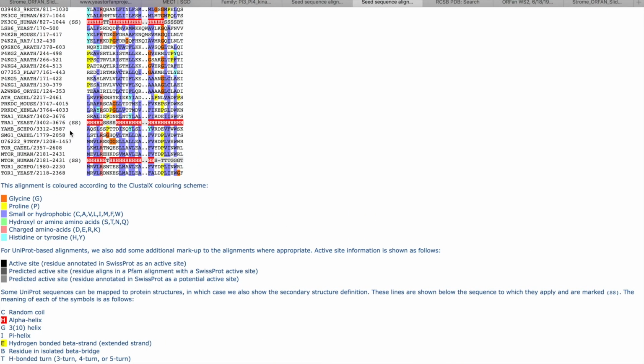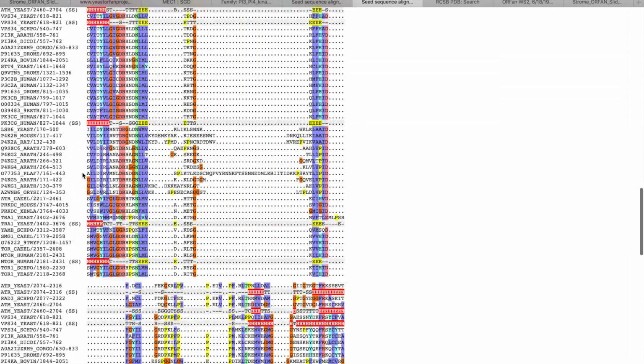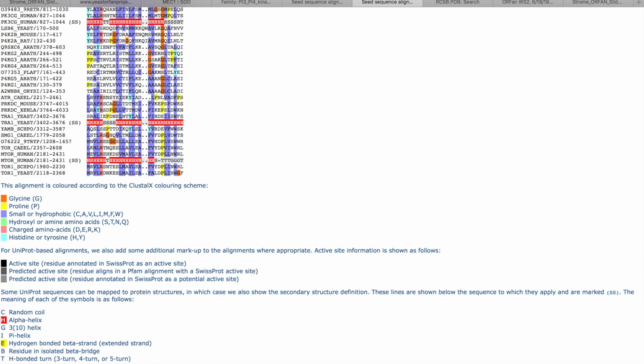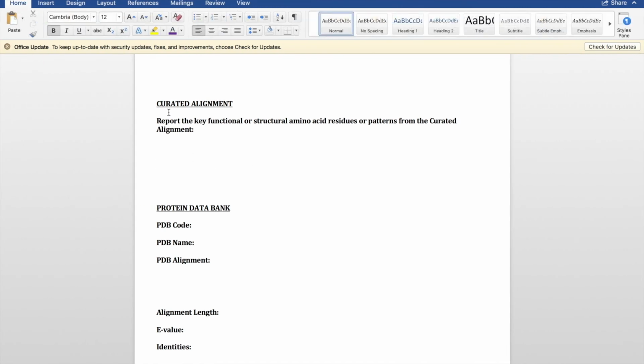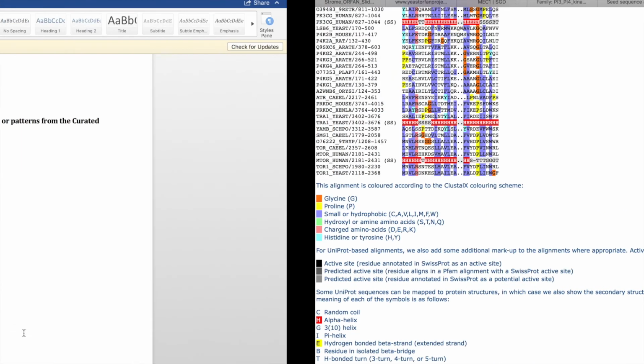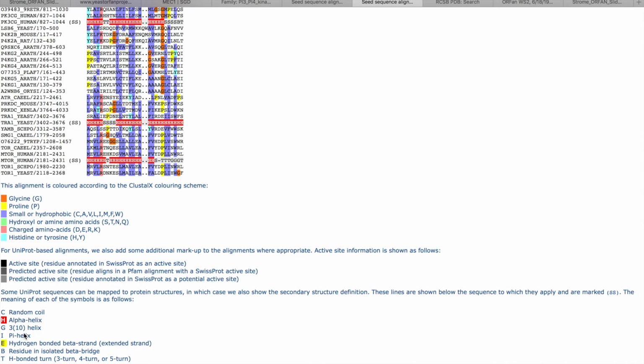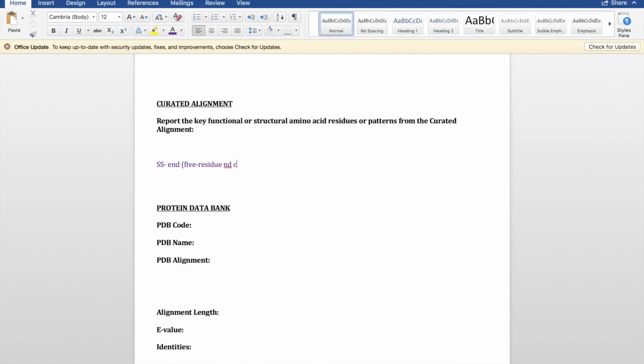So we have all of these S's appearing for mine. So I'm going to comment, and it doesn't look like the S appeared. I think it just got cut off in the video, but the S represents a 5 residue bend centered at residue I.